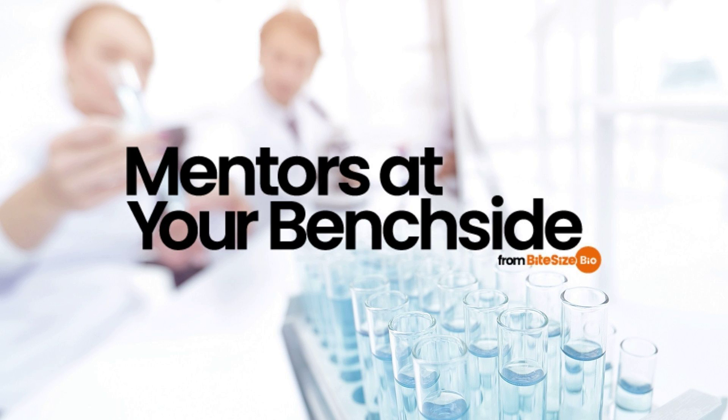Enter cryo-electron microscopy. The slow and inching progress of cryo-EM towards the scientific mainstream can be told as a story with three parts. 1. Three brilliant scientists successfully conducted fundamental research. 2. A struggle against the benchmark technique, X-ray crystallography. And 3. Landmark results in cryo-EM made it an attractive mainstream method.